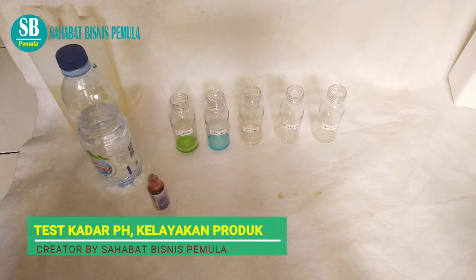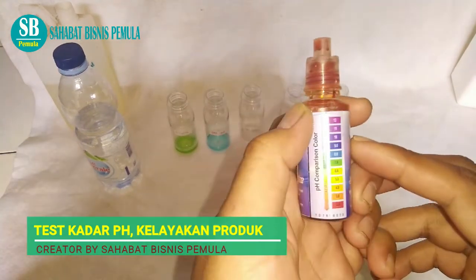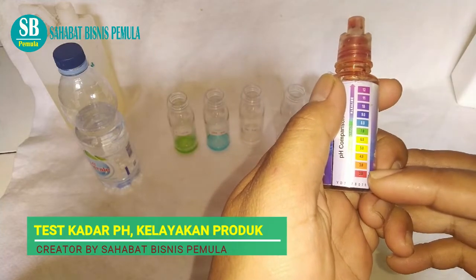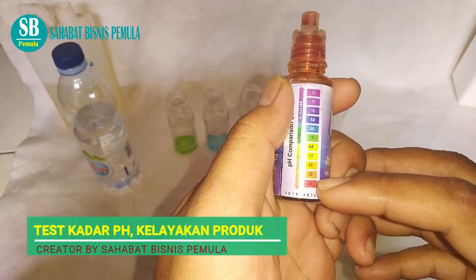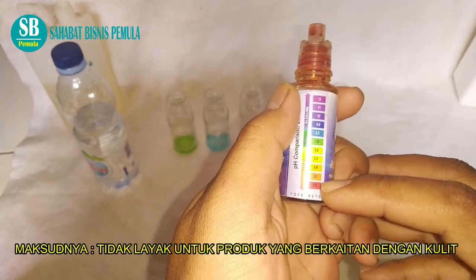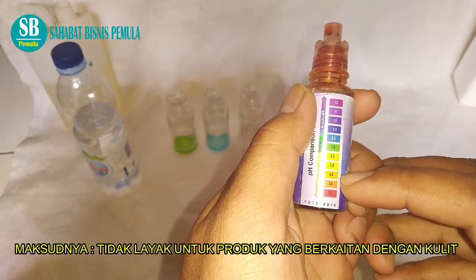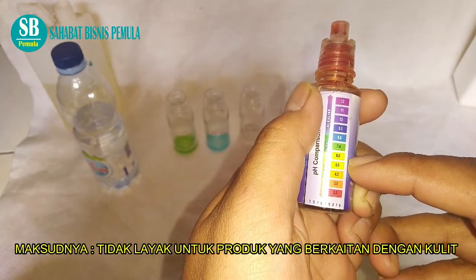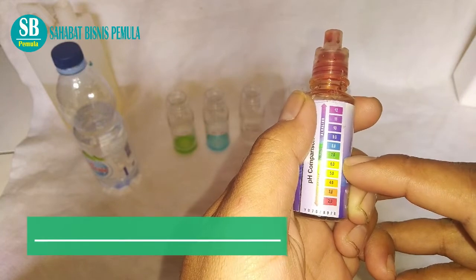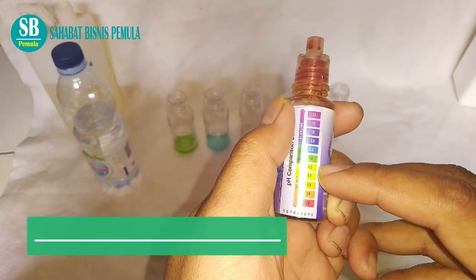Makanya kalau ada sabun yang gatel-gatel itu memang terlalu basah. Bagaimana saya mengukurnya? Saya mengukurnya dengan ini ya, alat pengukur pH. Ini adalah terlalu asam atau merah ya. Ini tidak layak untuk digunakan dalam produk. Karena kalau kita pakai itu gatel-gatel, kulit kita akan melepuh, berbahaya untuk kulit kita. Pokoknya yang dari 4 ke atas itu sudah berhubungan baik untuk kulit kita. Jadi 4 ke atas itu deterjen yang ramah lingkungan juga aman untuk kulit kita.